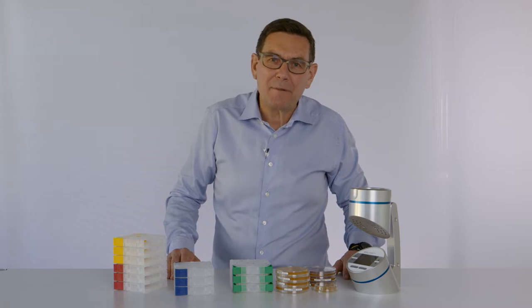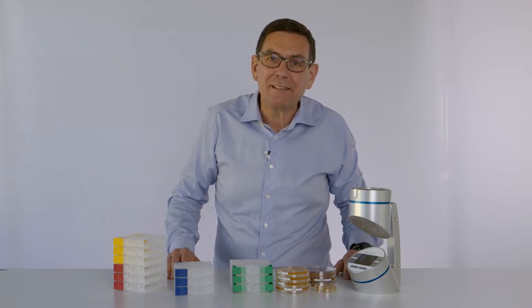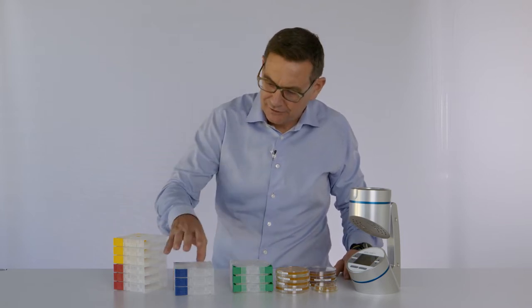Hi, I'm Roland from MBV and I can help you with safely handling Petri dishes and contact plates.